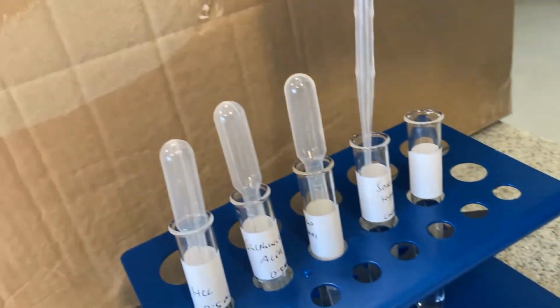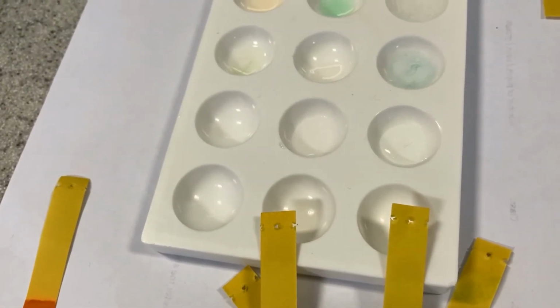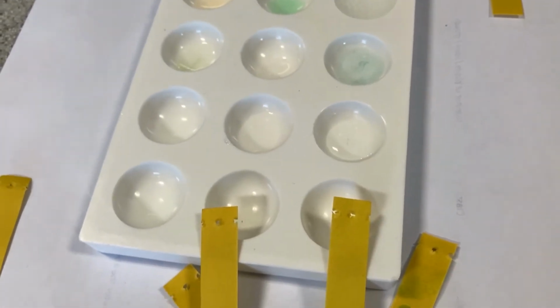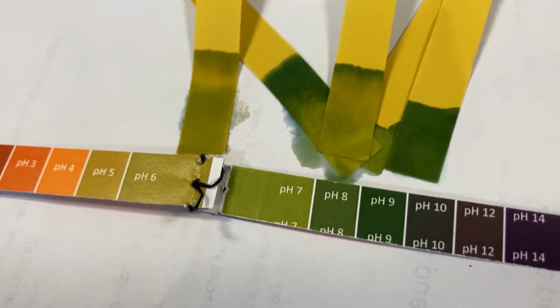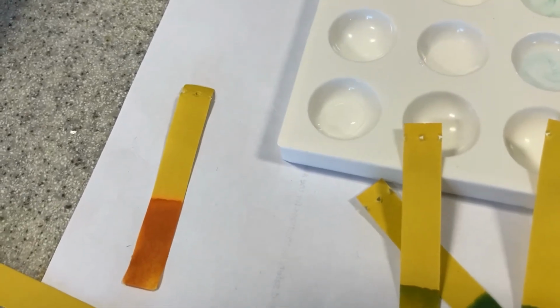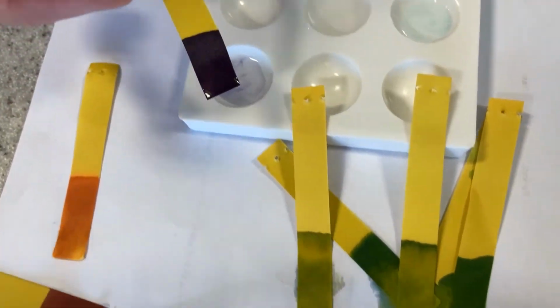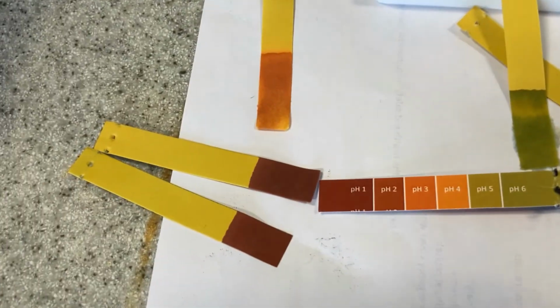Right. Sodium hydroxide. It's got the word hydroxide in. It's an alkali. I think, Miss, you weren't paying attention, and I think that was more than 4 drops. We have made an error. Right, we're going to have to run with it. Ooh, stronger. Much stronger alkali. And the last one is potassium hydroxide. It's got to be an alkali. I know it's an alkali because it's got the word hydroxide in. Quick one there. The colour of that, that's right to the end. That is a really, really strong alkali.